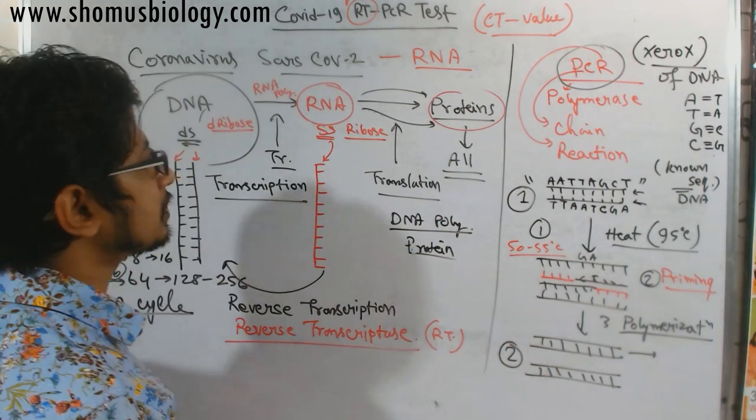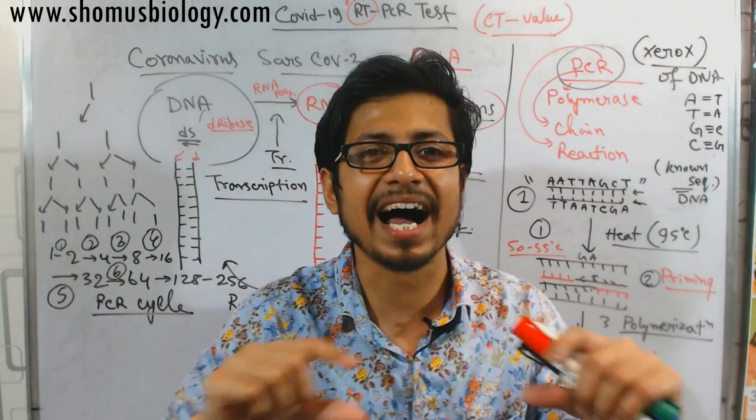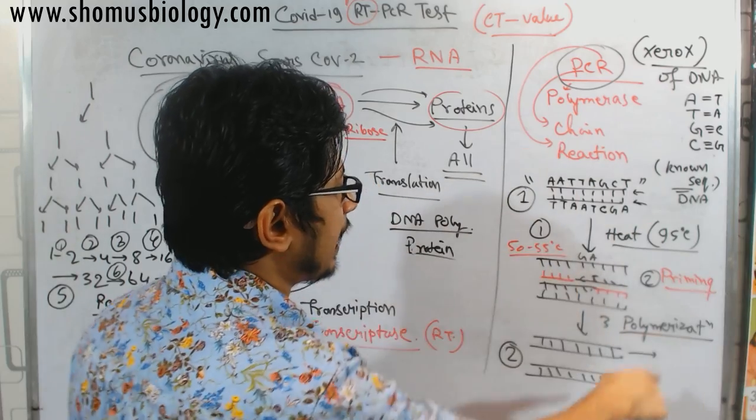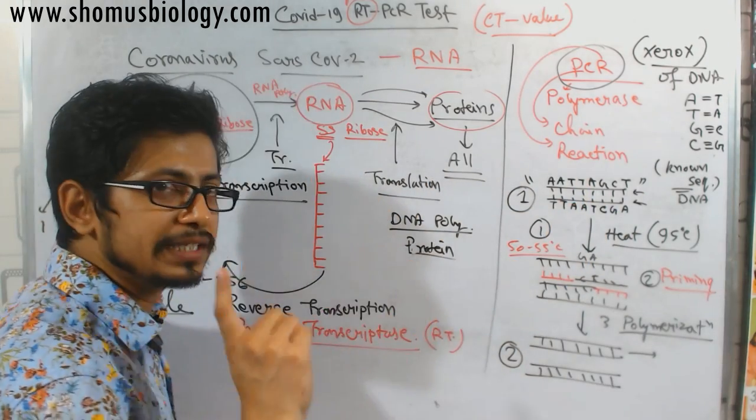And why reverse transcriptase? Because imagine, in SARS-CoV-2 the novel coronavirus carries RNA as its genetic material, and in this case I taught you the process of PCR with DNA, and PCR always works with DNA.